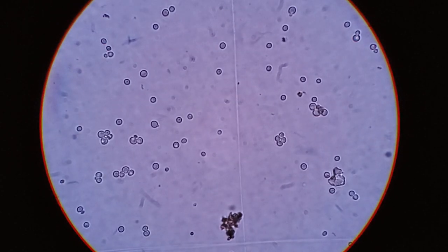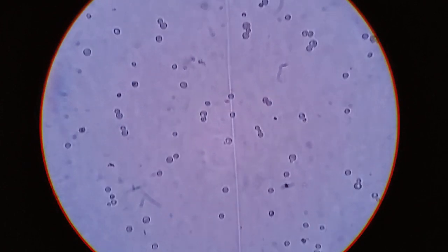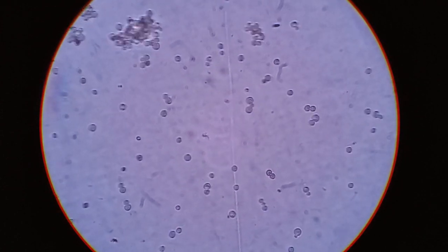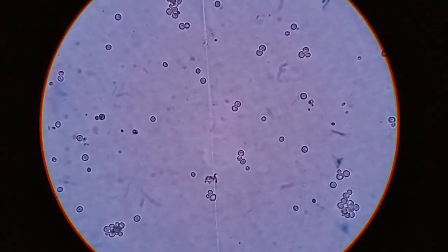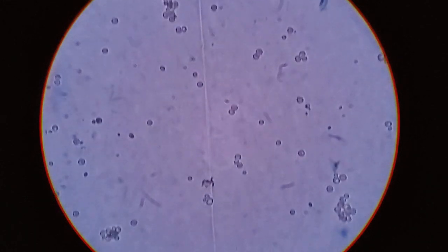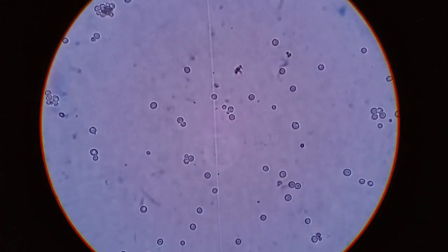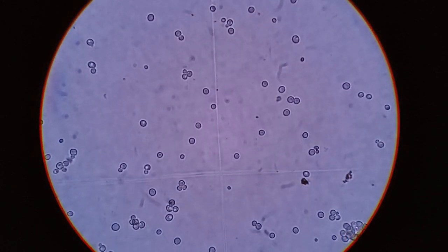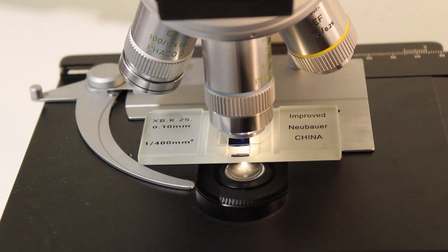So if you've stained an undiluted yeast sample you need to use a dilution factor of two because you added an equal amount of tri-pan blue and yeast. If you diluted your yeast sample 10 times before adding the tri-pan blue you're now working with a 1 in 20 dilution. So this is how to perform cell counting with a hemocytometer and how to combine it with viability staining to count only viable cells.